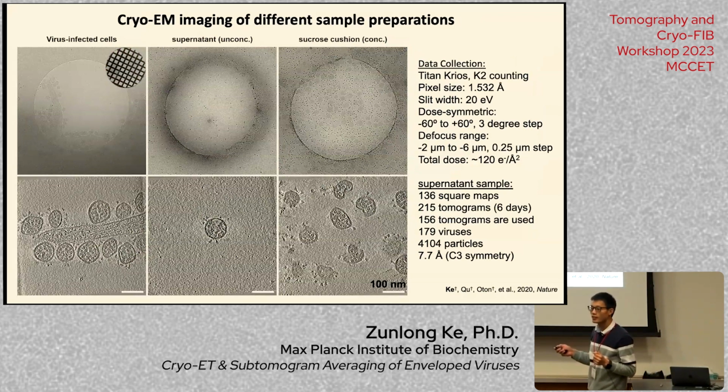Like here, yes. If you want to go this path, my PhD work with Liz was essentially this: we collect virus assembly at the edge of the cell, and that's the only thing we were, at the time, interested in, to understand these different assembly stages. The best you can do is try hard on the optimization of your sample.